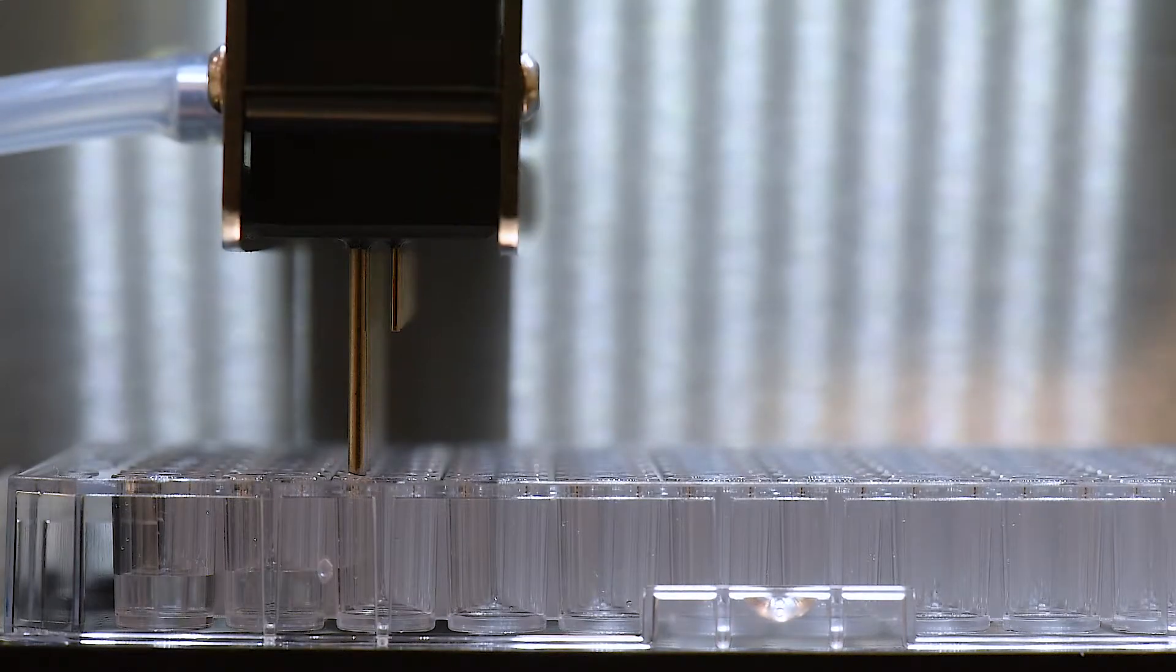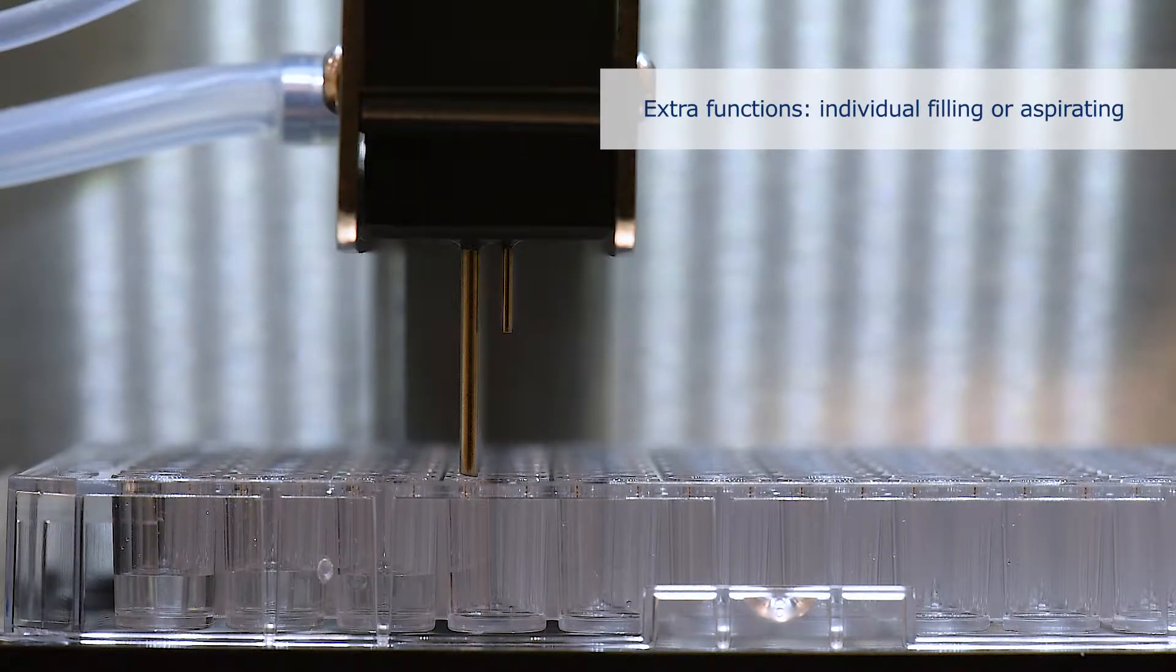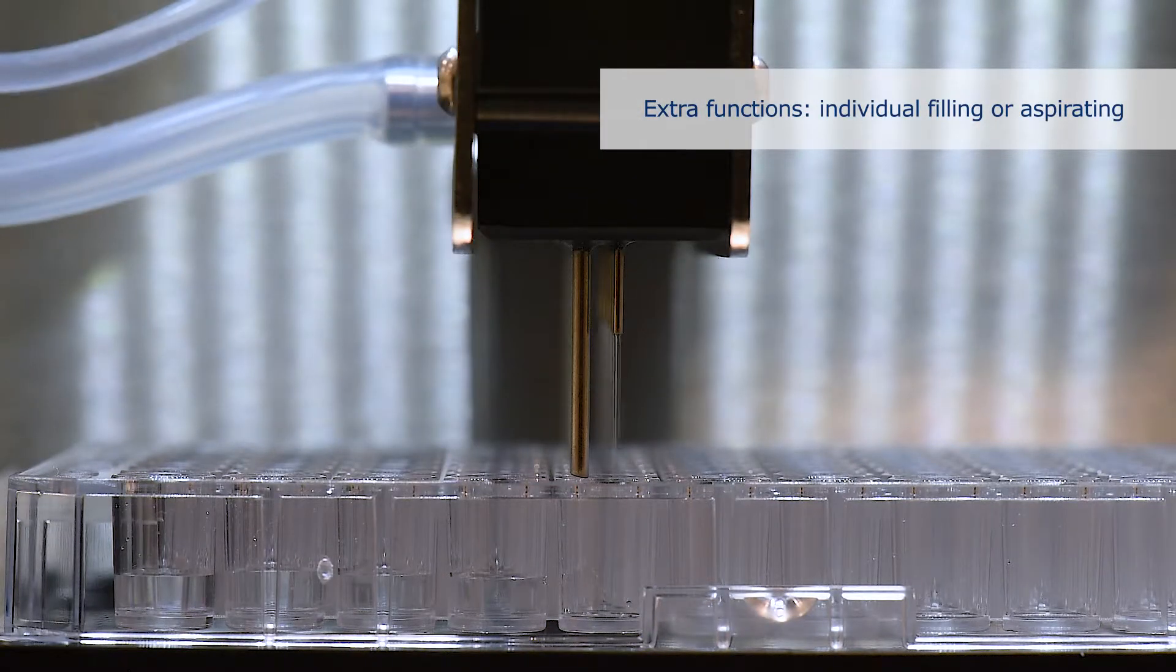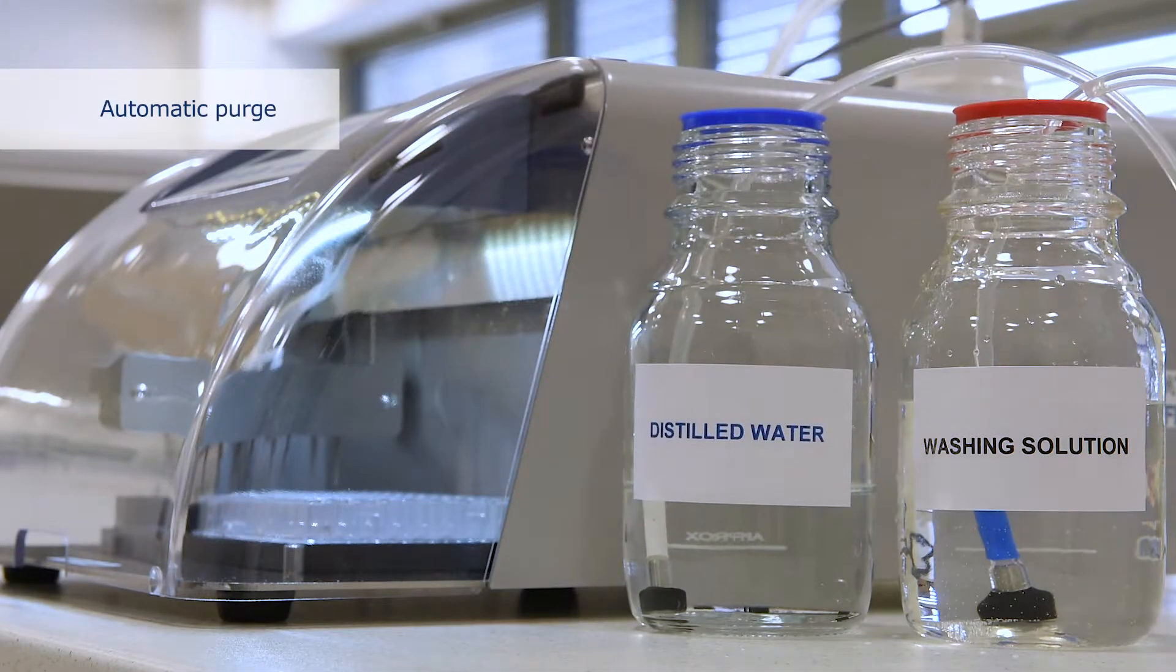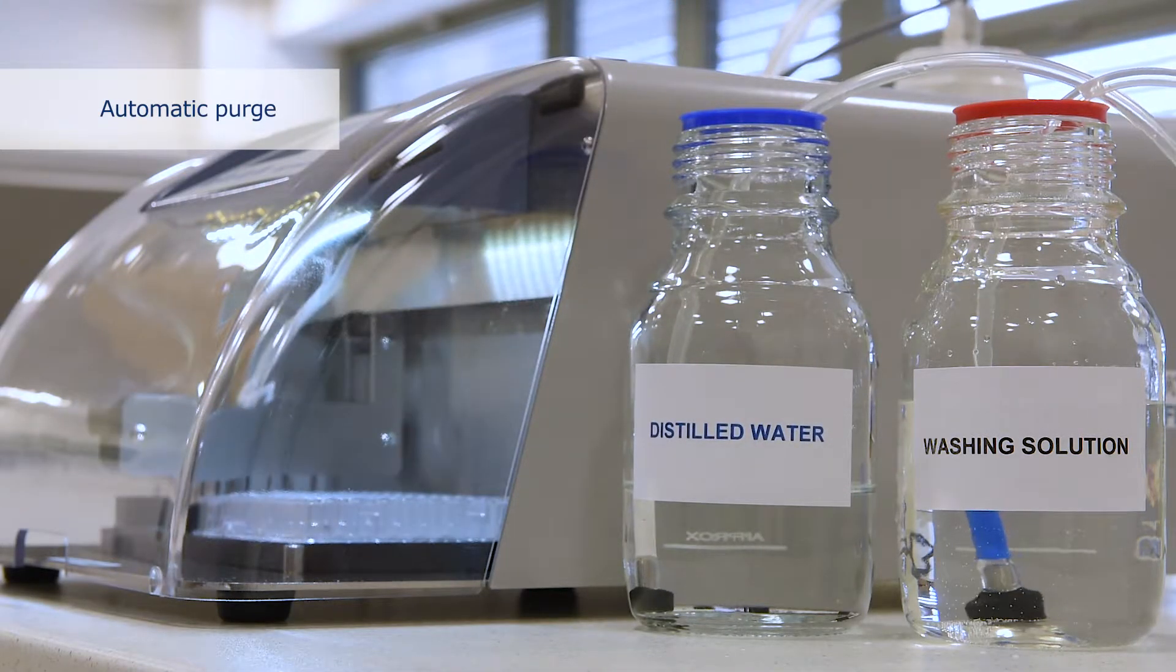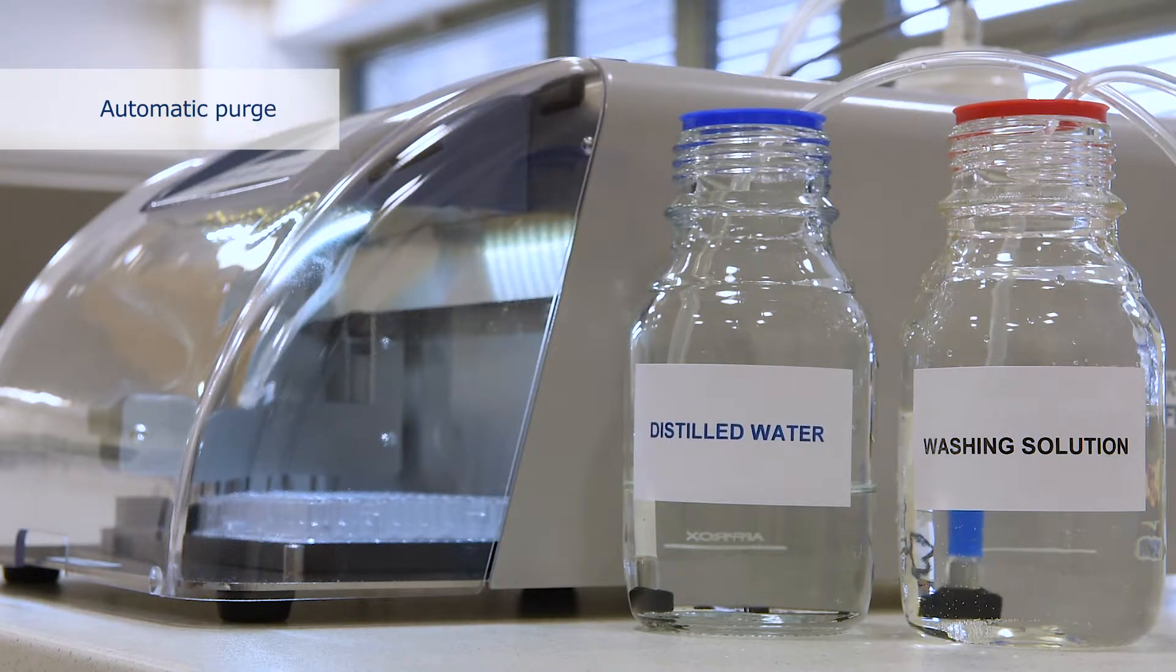The DynaWash Automatic can be used for a separated function of filling and aspirating. If the user connects distilled water to the washer, then the automatic purge can be performed after each washing procedure.